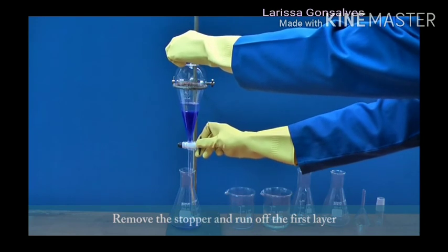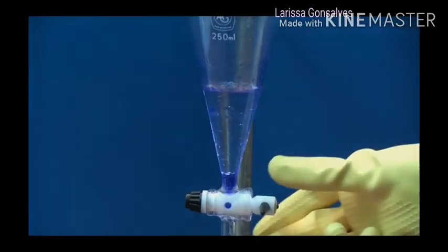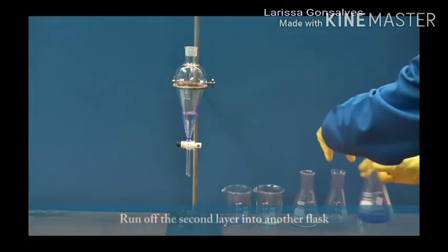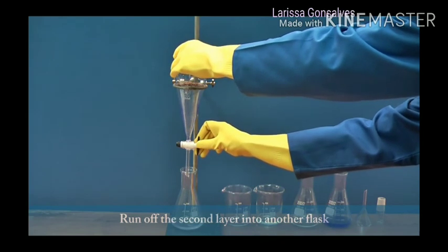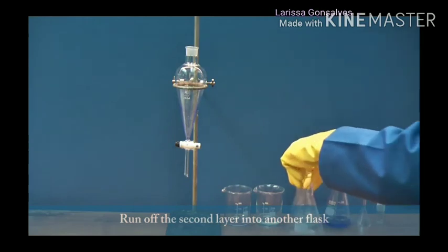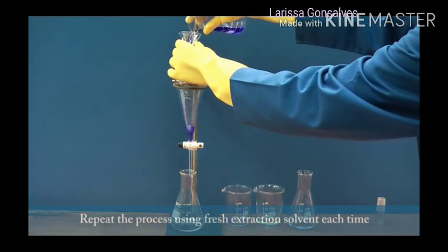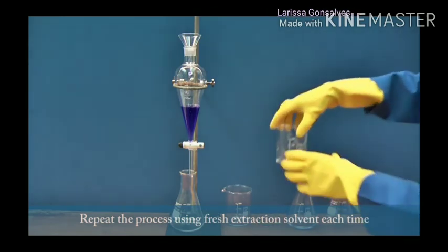Now we need to keep a beaker below the separating funnel to remove the layers carefully. The knob is opened and we are collecting the first layer. Some part of the first layer can be discarded. The organic substance is then collected in another beaker. If the solute is less soluble in the organic solvent which is used, then the same amount of organic solvent is used to carry out the extraction repeatedly, and this is called continuous extraction.